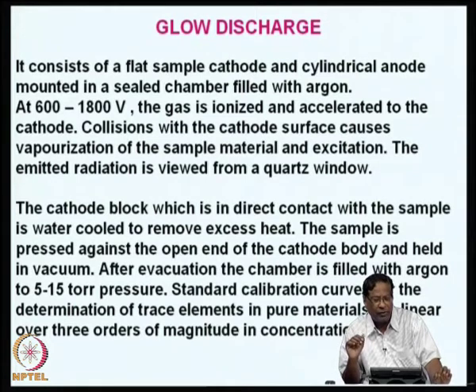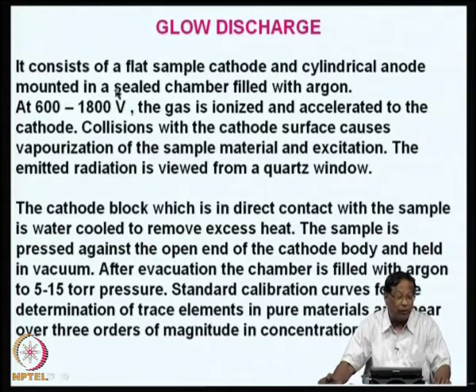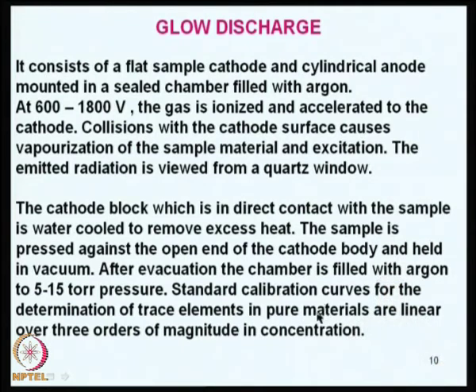It is very low pressure, and standard calibration curves you have to make anyway in almost all spectrophotometric or spectroscopic techniques for the determination of trace elements in pure materials. The order of linearity is put here in the last line.